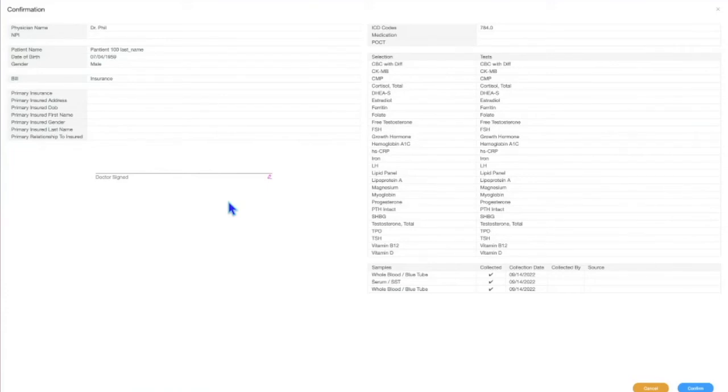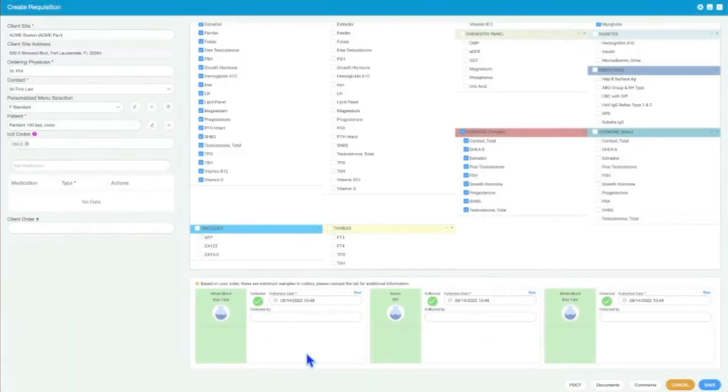Like I said, at the end of the day, they go in, 10 orders for 10 of the patients, select them all and sign. So fairly easy to sign 50 orders, 100 orders in less than a minute. But it's good because they sign and you have that. Depending on the doctor, your agreement, whatever, if you don't apply it automatically, that means somebody needs to apply it manually, and that's what I'm showing here. But we can definitely put it automatically. That's for specific doctors or specific clients or specific insurances. That's how you place an order.